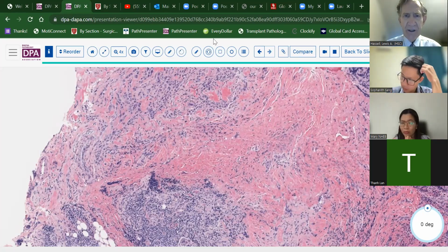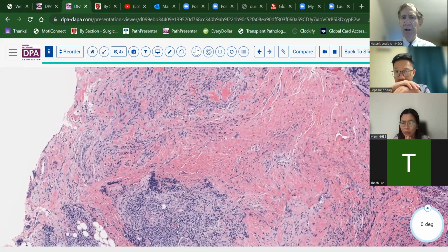And question, does the papillary architecture affect the degree of endometrioid carcinoma? So I think in endometrioid type adenocarcinomas, there can be papillary architecture. It's usually more on the macropapillary feature, but there are actually some low-grade endometrioid carcinomas that can have a very micropapillary component.